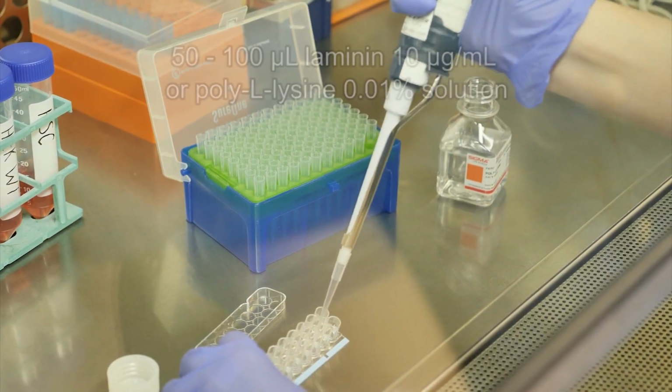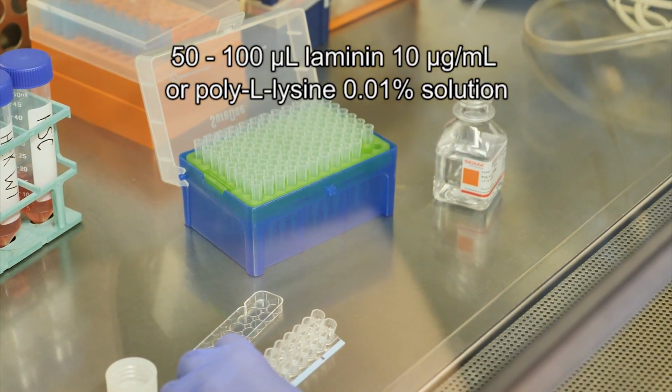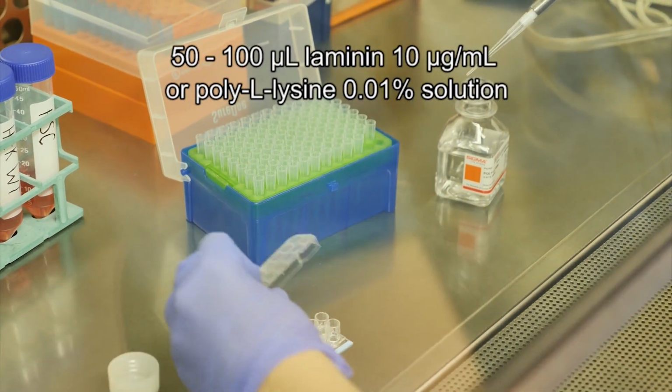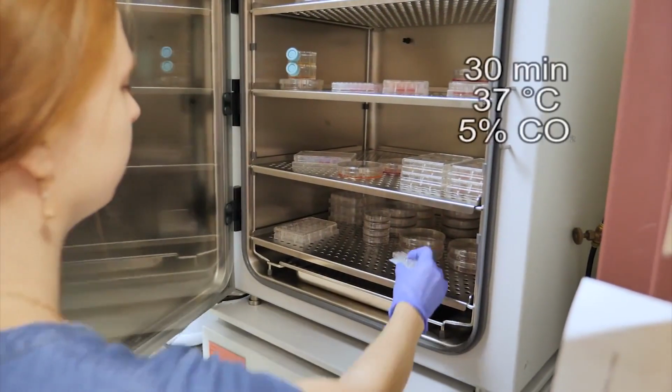On the day before the experiment, coat 16-well chamber slides by adding 50 to 100 microliters of mouse laminin or poly-L-lysine and incubate at 37 degrees Celsius.